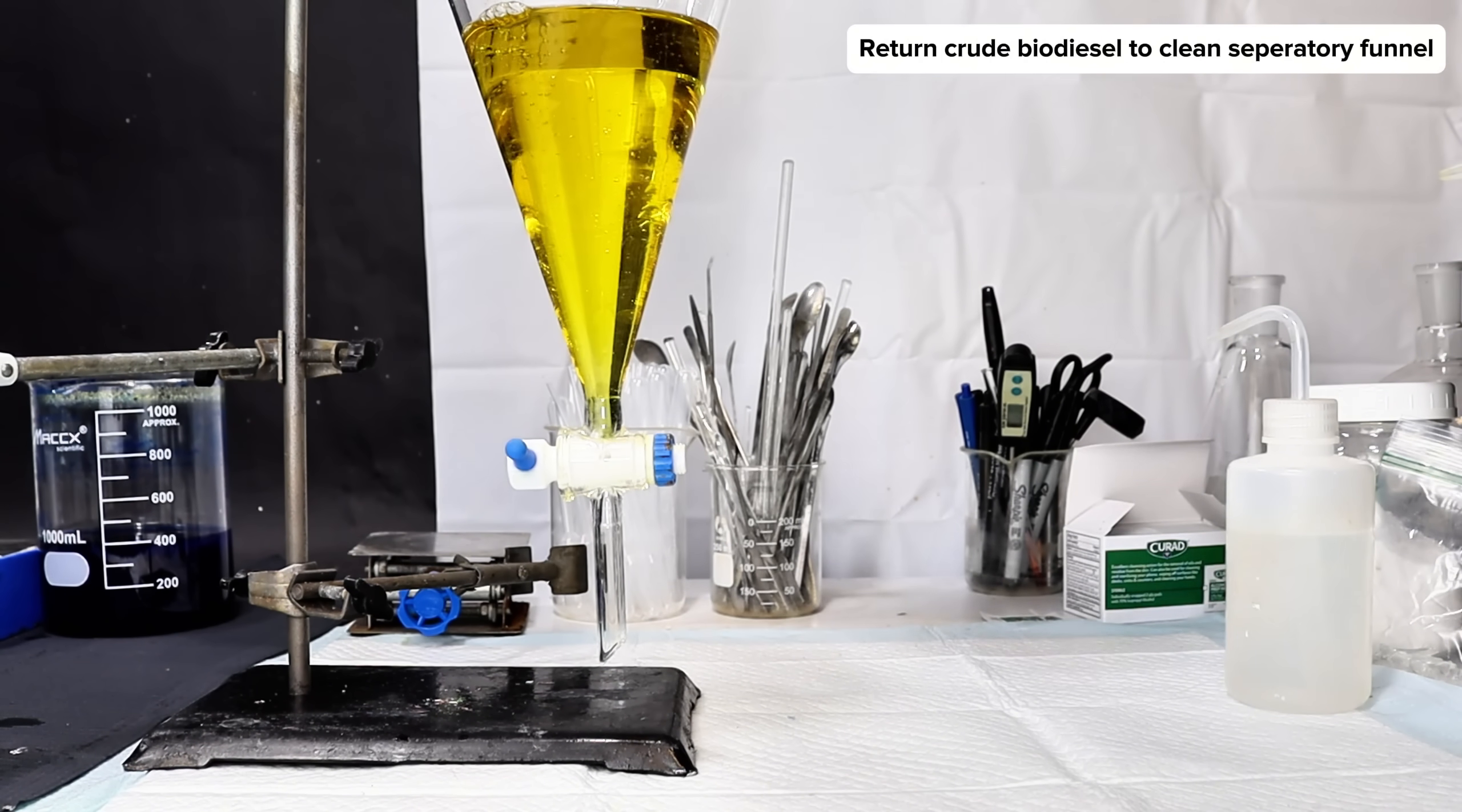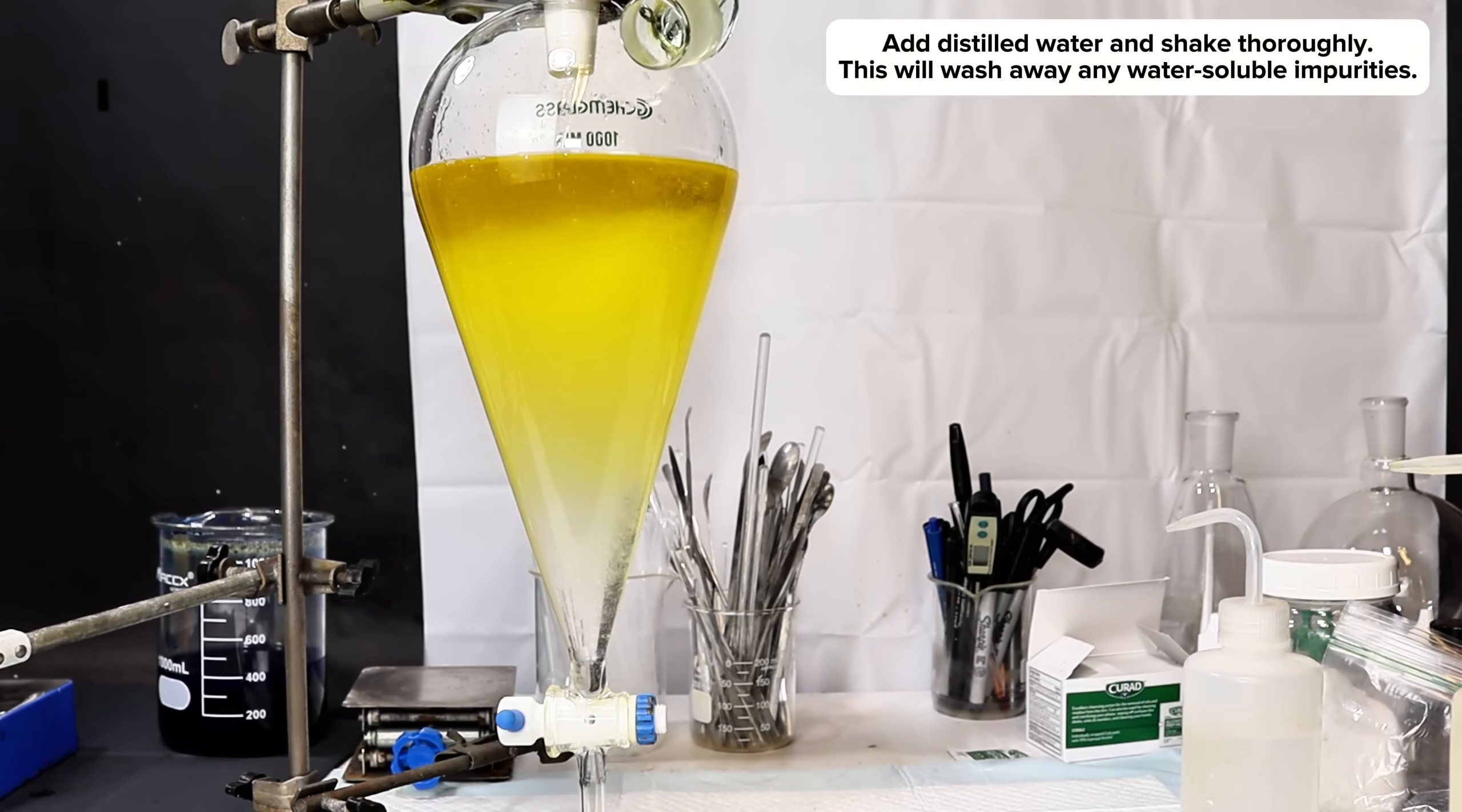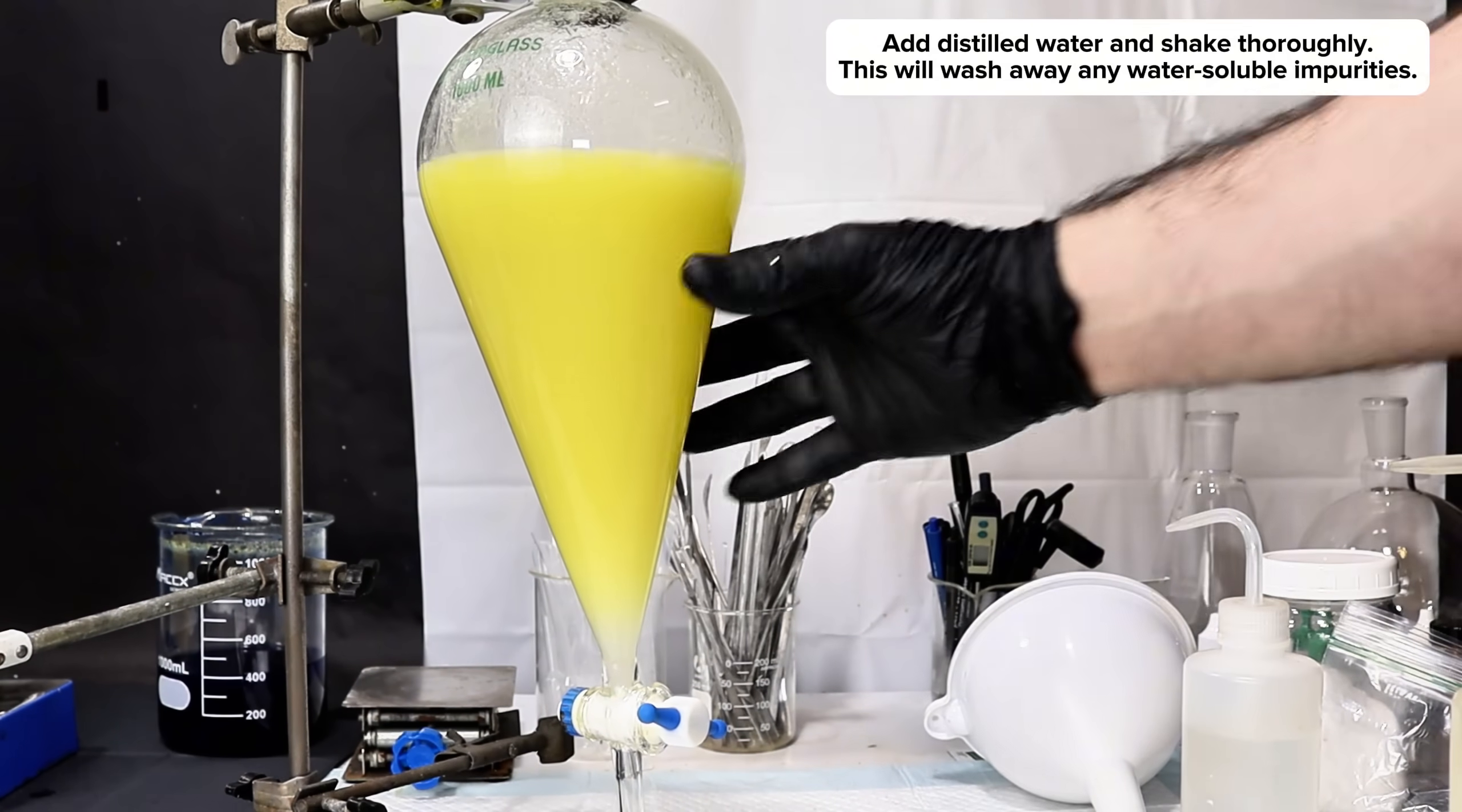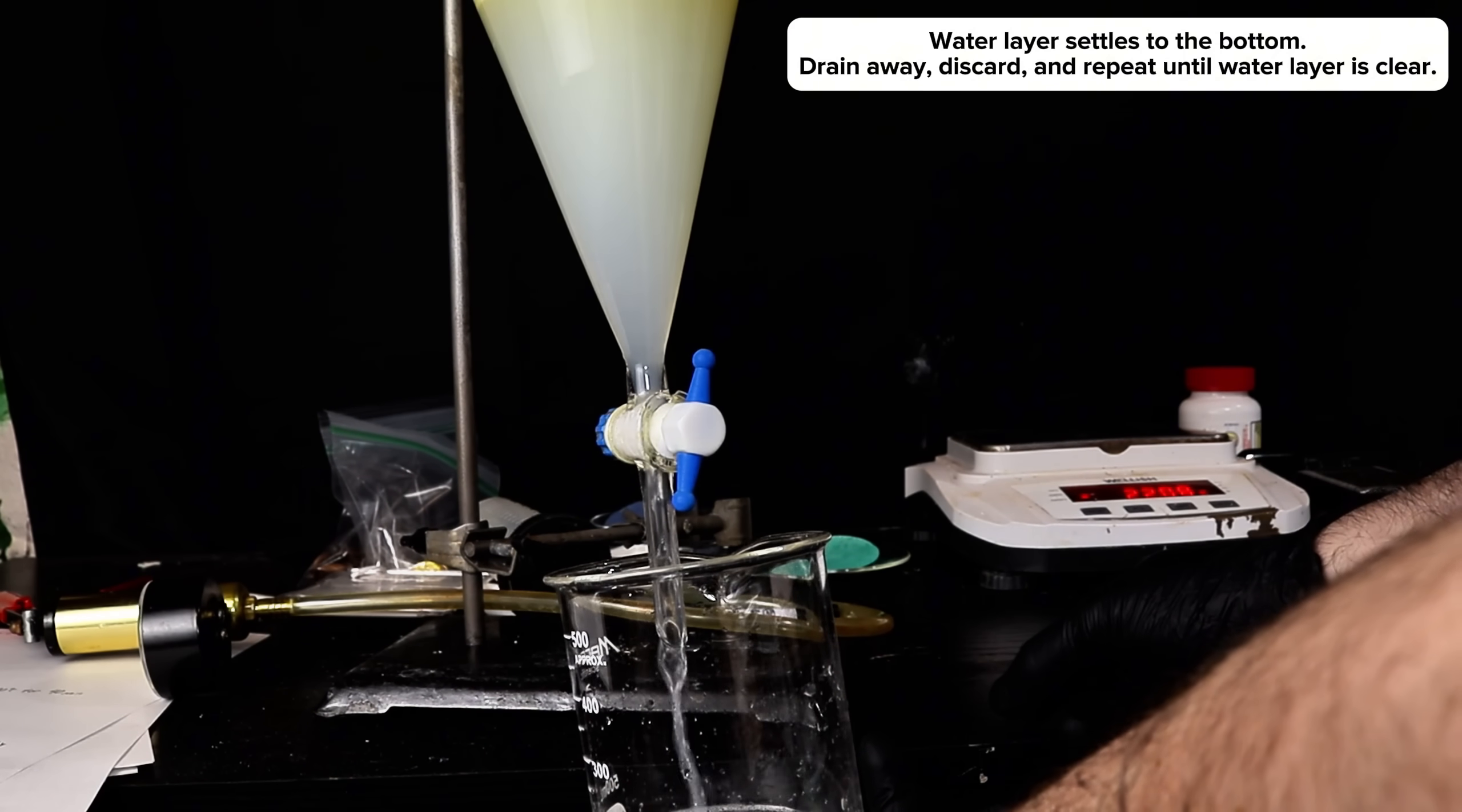Once it was nice and clean, I returned the biodiesel to the separatory funnel along with 400 milliliters of water. I gave this a vigorous shake and allowed the aqueous layer to settle to the bottom. This step will help wash away any soaps or unreacted hydroxide from the biodiesel.